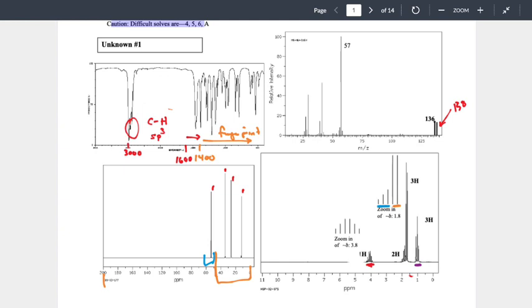Where did that signal appear in that chemical shift range? If it's between 0 and 2, that hydrogen is likely bonded to carbon. Okay. What if it's at 4? If you haven't memorized all the ranges, that's going to be problematic. Because you happen to have the sheet in front of you, it says that what shows up at 4 is everything else. I don't know what shows up there.